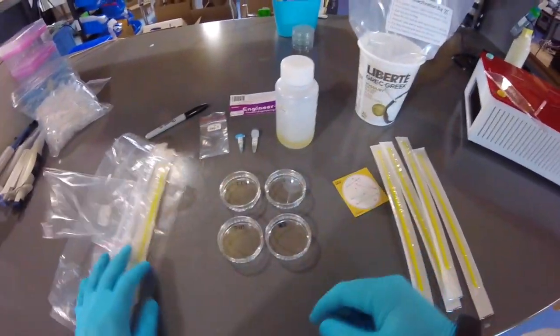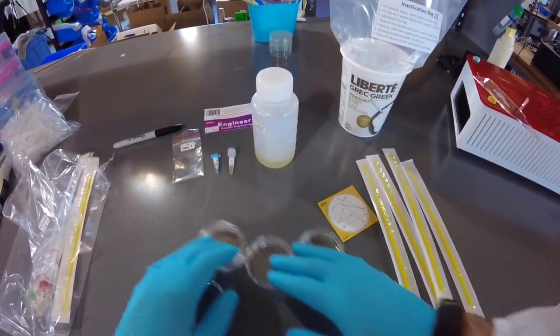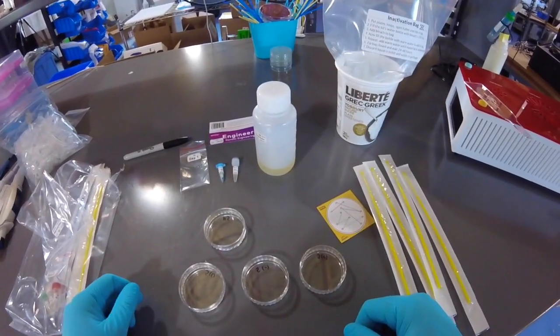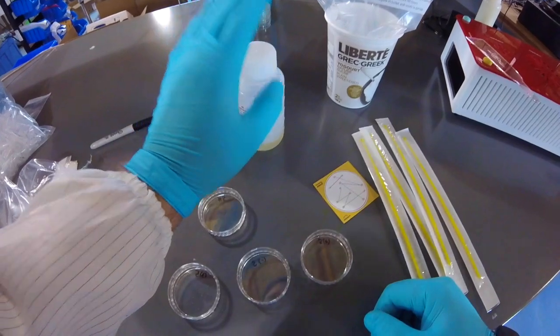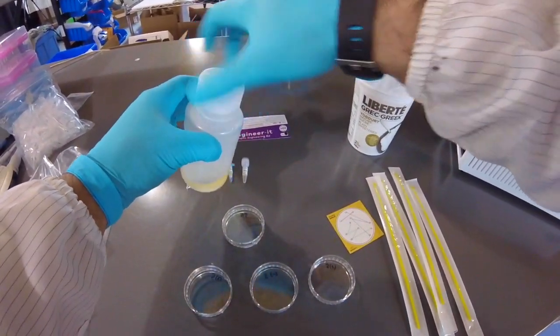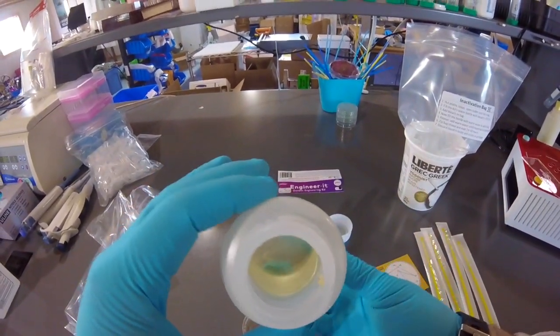All right, so we have 4 plates here. 3 of them are selective, meaning they will have antibiotics, and 1 is non-selective, meaning there's no antibiotics. You might realize we haven't added any antibiotics yet, so we can go ahead and pour the non-selective plate. And if you look into it, you'll see that it's quite clear.